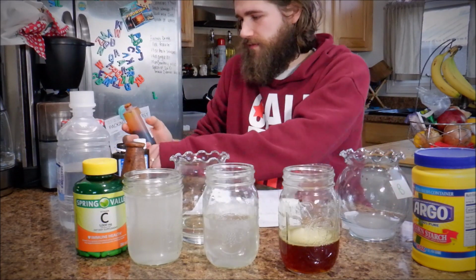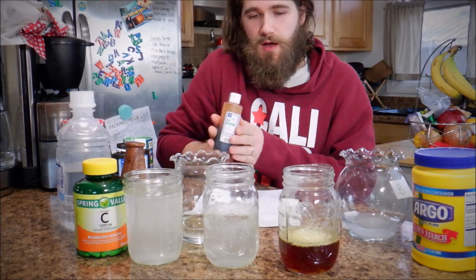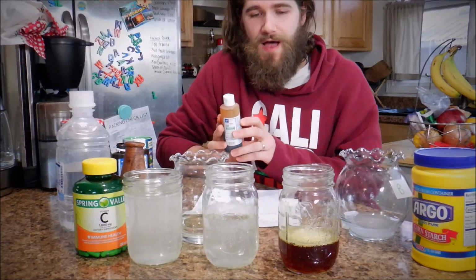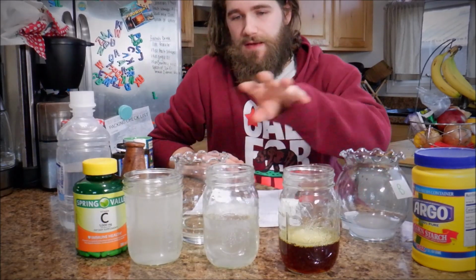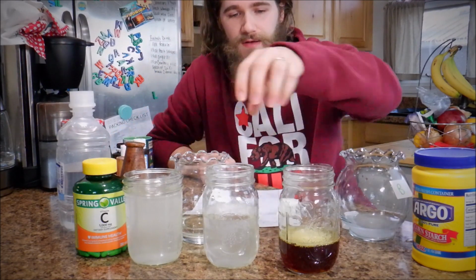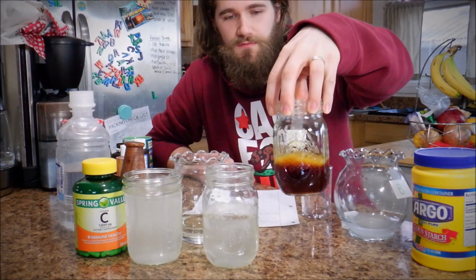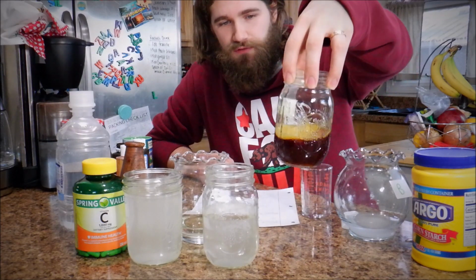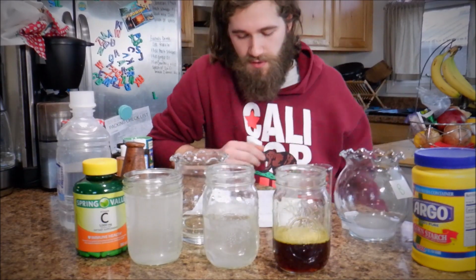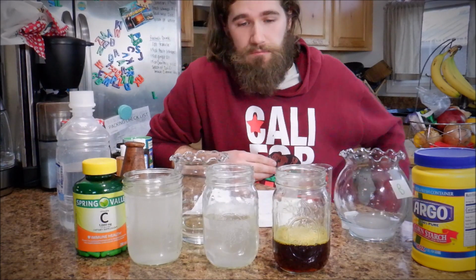So because even though this is 10% povidone iodine solution, it is only equivalent to 1% available iodine. So that's why we needed to increase instead of decrease the concentration of the povidone iodine in the solution. And as you saw, it was able to change colors back to this darker solution, as we talked about before. Basically the two reactions competing.